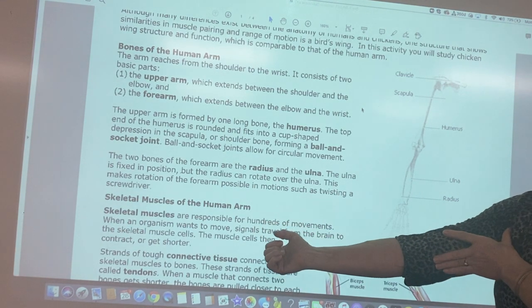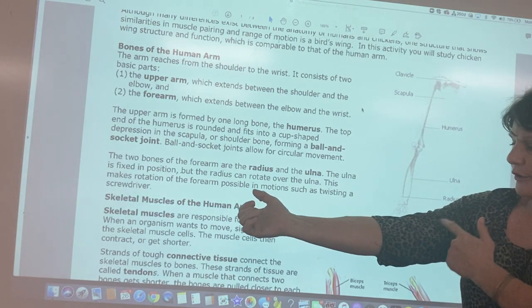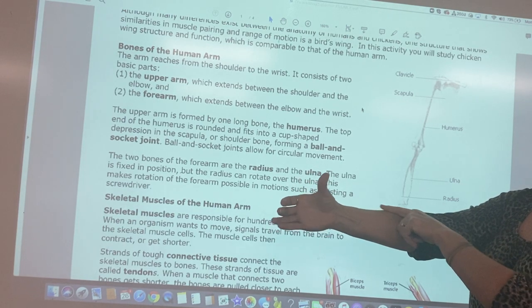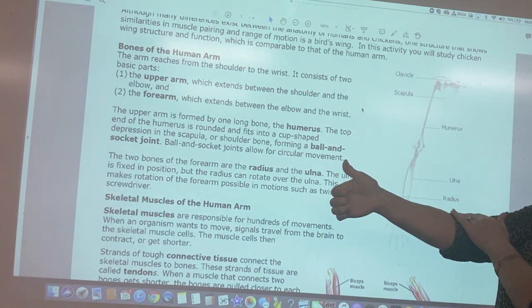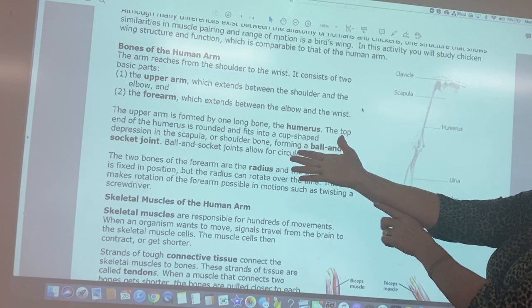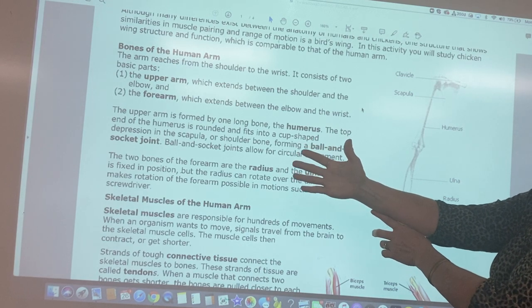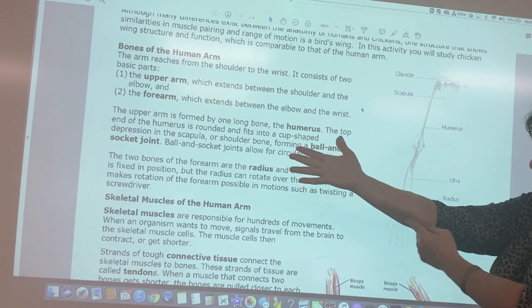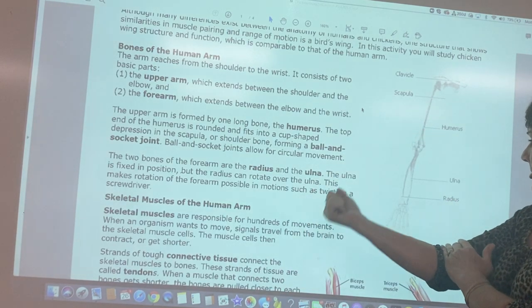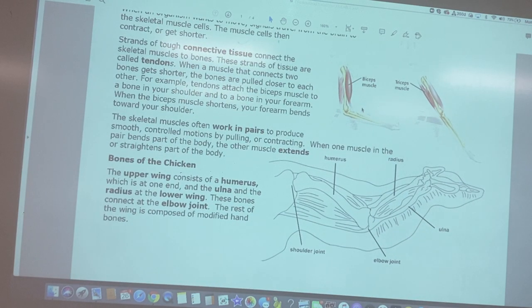At the top we have this long bone called the humerus — I remember it because it's not very funny when I hit that nerve, the funny bone. Down in the forearm we have two bones: the radius on top, which I remember because I can radiate or rotate my thumb, and the ulna on the bottom. Ulna starts with U, pinky with P — ulna pinky. This bends at the elbow, a hinge joint, and we also have phalanges and a thumb.